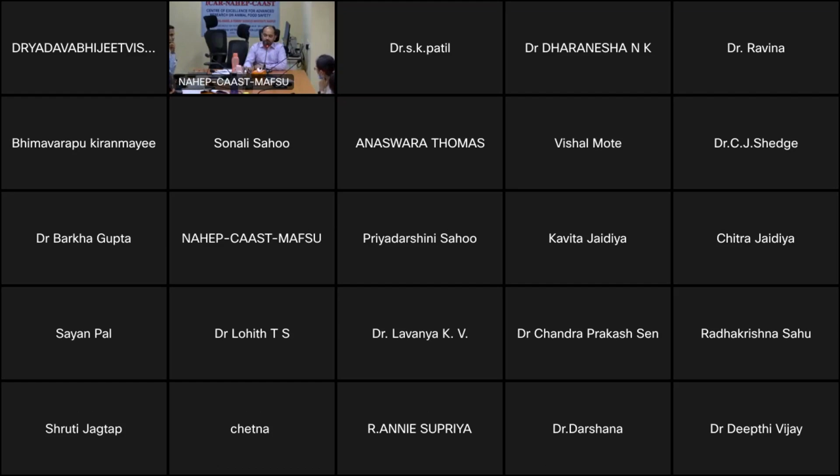Yeah, so basically, the column selection will be based on the physical chemical properties of the molecules, basically the pK values of the molecules which are present in the sample. Oh no, it basically depends on the separation which you are getting between the compounds.